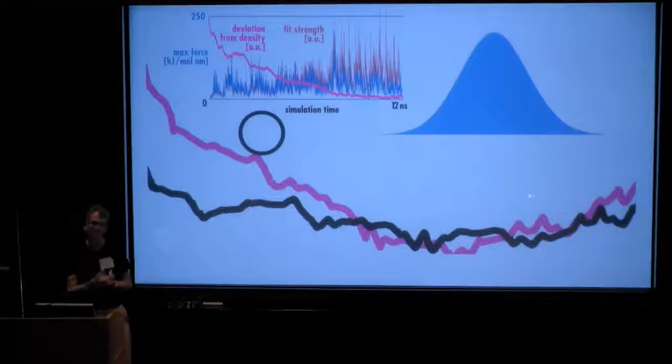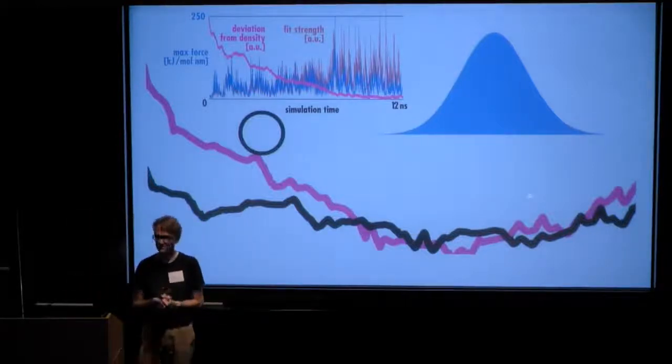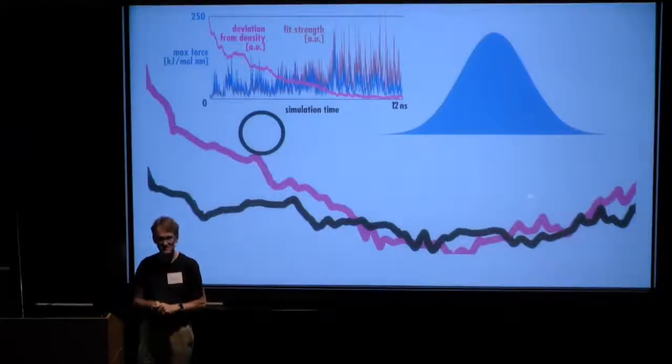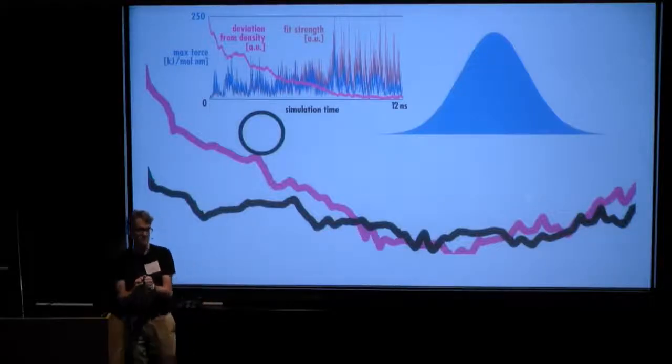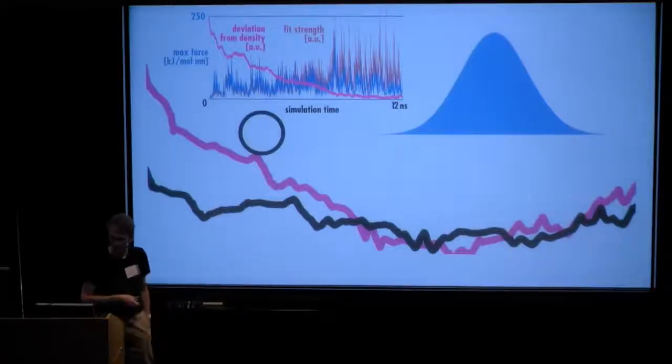But what I like with this is that we're not necessarily tethering the molecule very hard. Once the molecule fulfills the cryo-EM density, we're not really pushing it. Then we're letting it explore that part of phase space, which means that we're not just pulling it as hard as possible to the center of the density, but as long as you fulfill the density, it's free to explore the ensemble and sample things as if it was a normal molecular simulation.